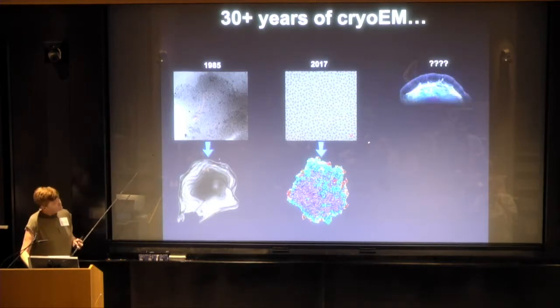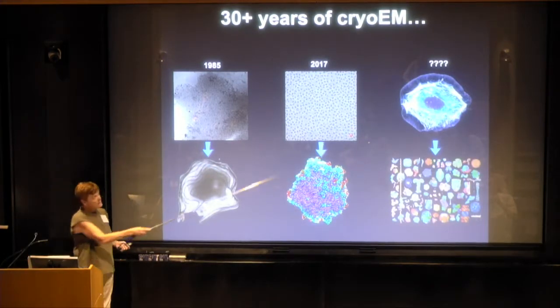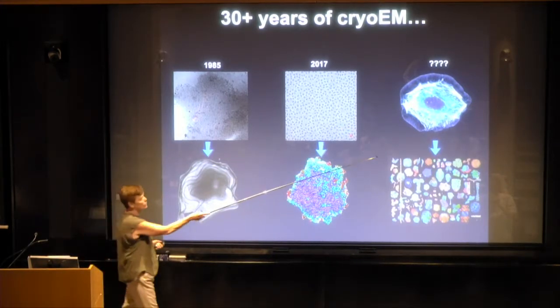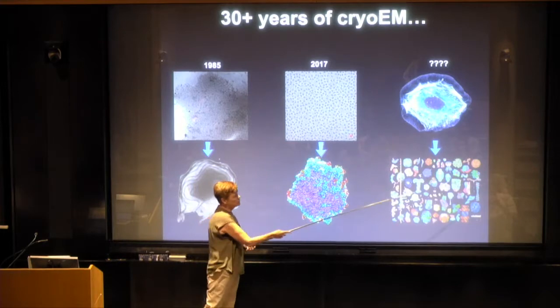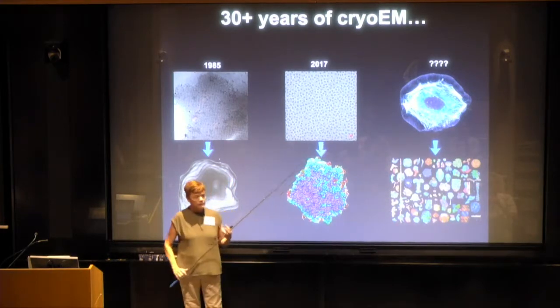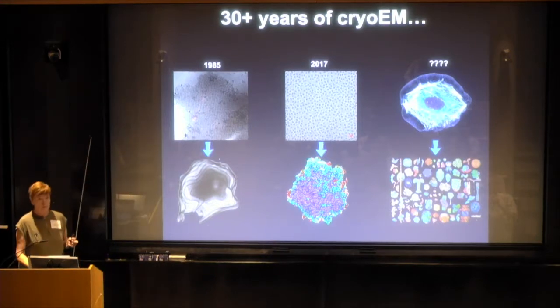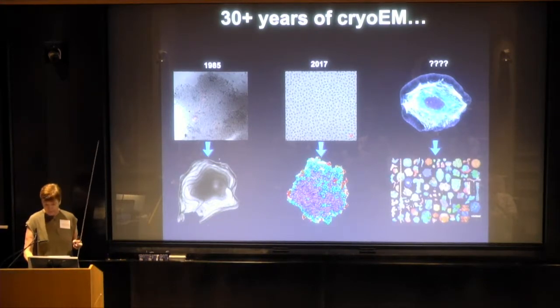Maybe Richard did. And now, of course, because we can go into the cell and dig out the molecules, what we really hope sometime in the future is that we're cataloging, at high resolution, molecules out of the cell and finding out what they do and where they are.